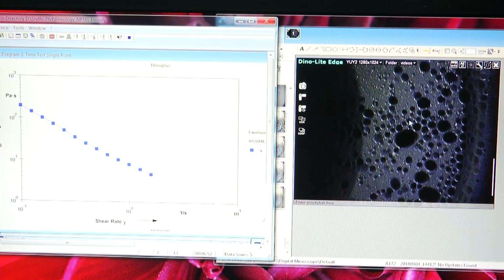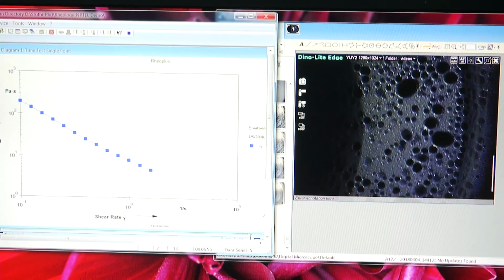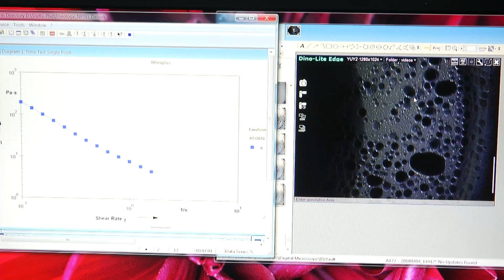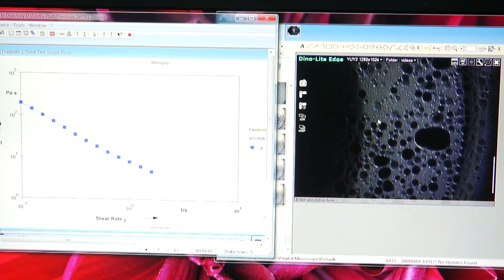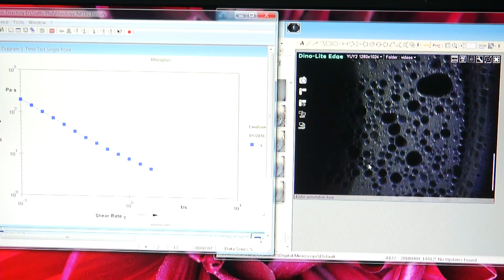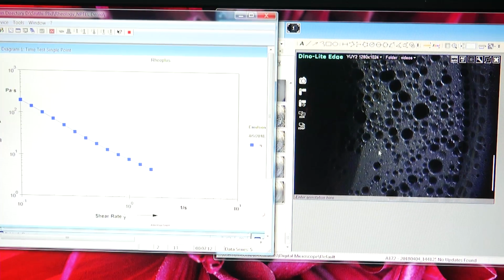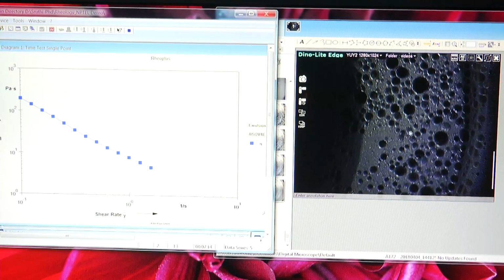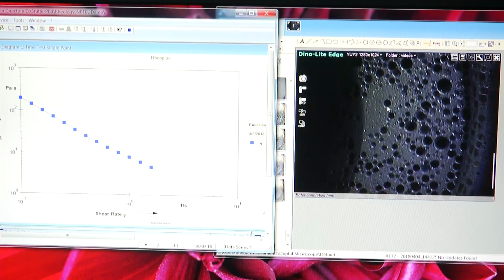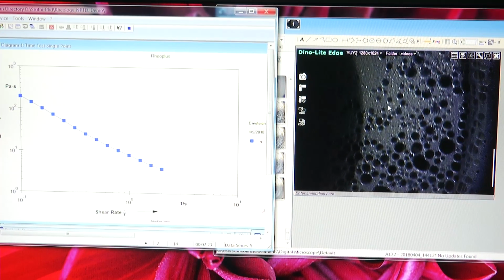Another important thing to notice is in this parallel plate flow, the direction is in the theta direction. So you can see how all the droplets are moving nicely in theta direction. Therefore, the assumption of one dimensional flow seems to be quite reasonably valid. If this droplet is there, it's moving only in theta direction. Droplets are not moving in this or the other direction. Similarly, a droplet which is in focus remains in focus, which means the z direction motion is also not there.